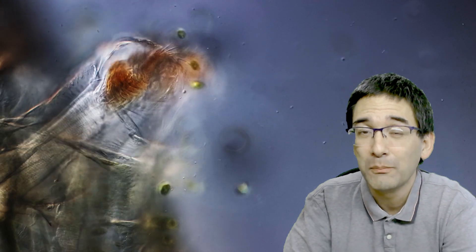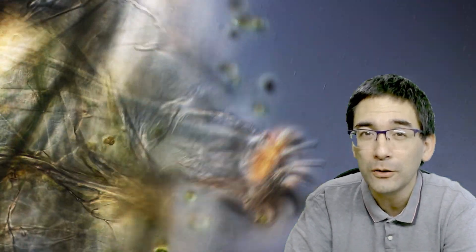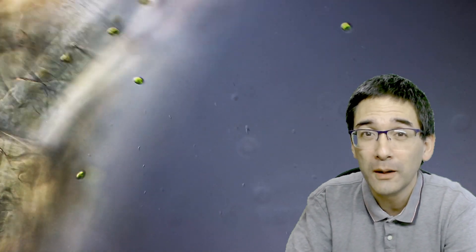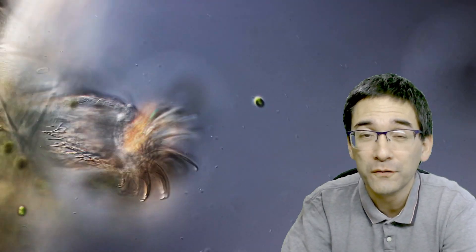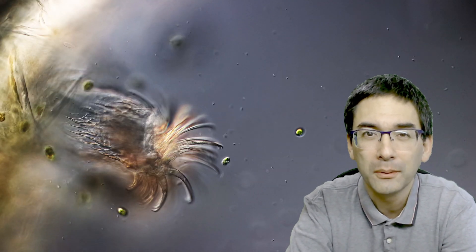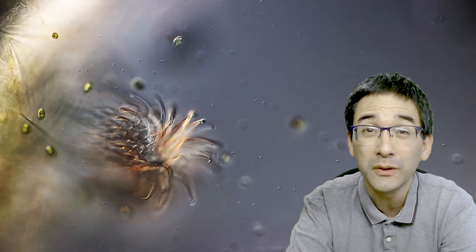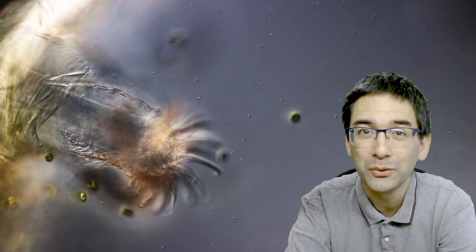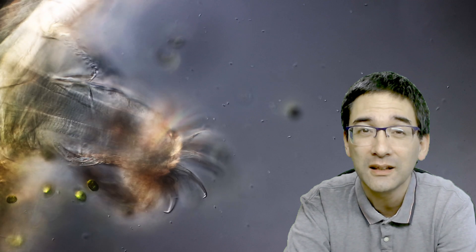This kind of reminded me a little bit of the feet of a gecko. Geckos are able to move up vertical surfaces like walls, and for many years scientists were wondering how is it possible that they are able to crawl up even smooth surfaces. They don't have suction cups or a sticky slime layer or anything like that.